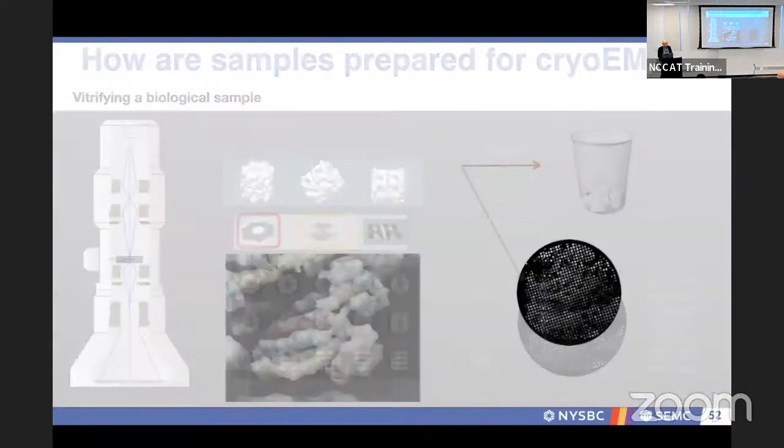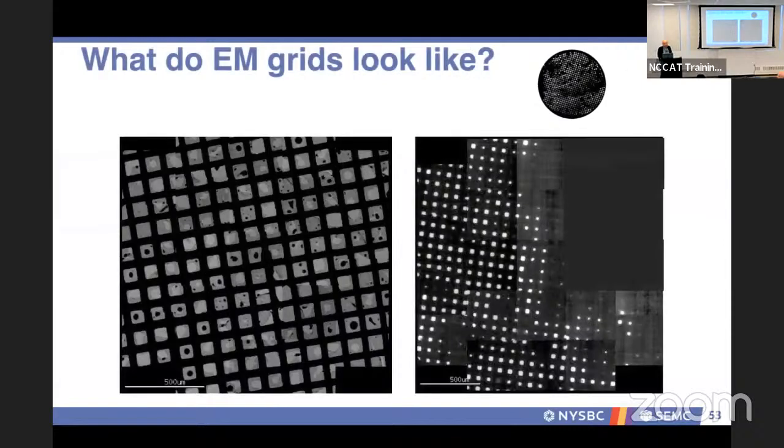The hard part when you're putting a sample into a microscope is interrogating what is a good grid. So are these good grids? What happens if I told you both grids gave 2 angstrom resolution reconstructions? What is a good grid? What is a good micrograph?